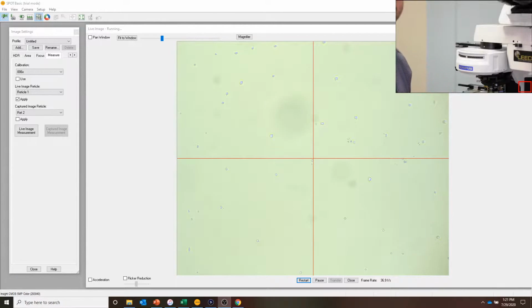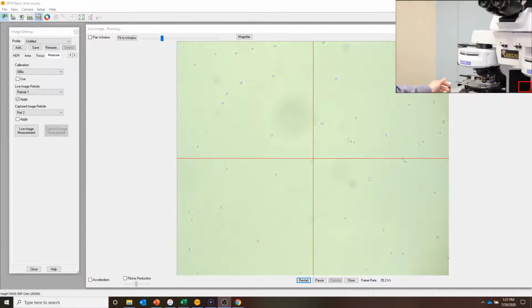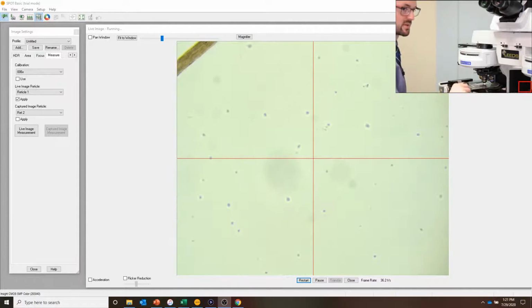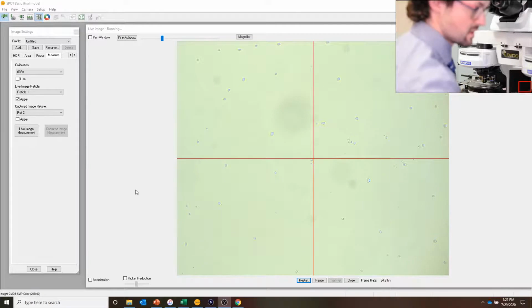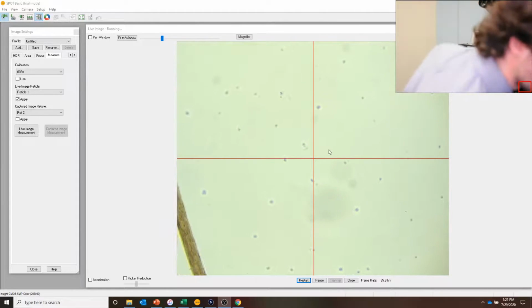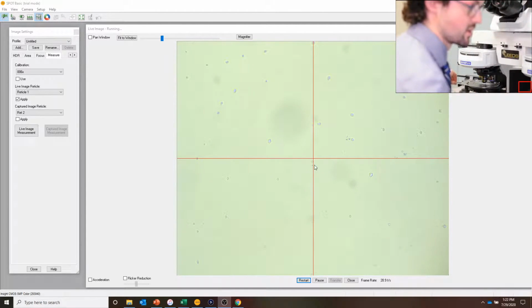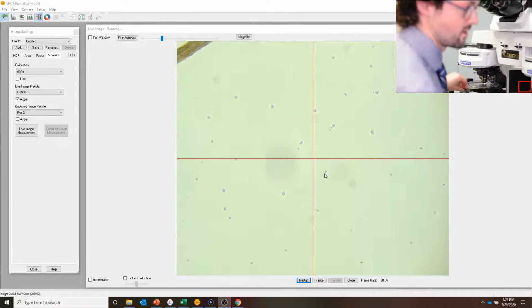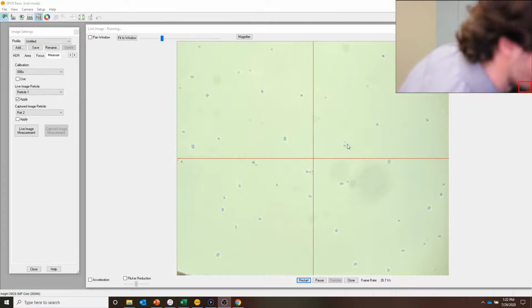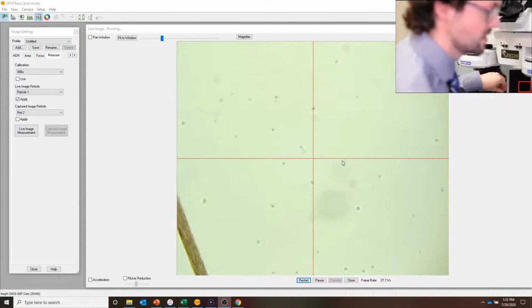And now what we're going to do is rotate that stage. Zoom out a little bit. So I'm going to go ahead and grab the stage. We're going to rotate it and just see what happens with that dust mote. Where does that dust mote go? So what we can see here is as we're rotating it, it's making kind of this big circle, and you can kind of imagine where it's going to go with that. So it's going to go down, up, around, and probably basically would continue back.